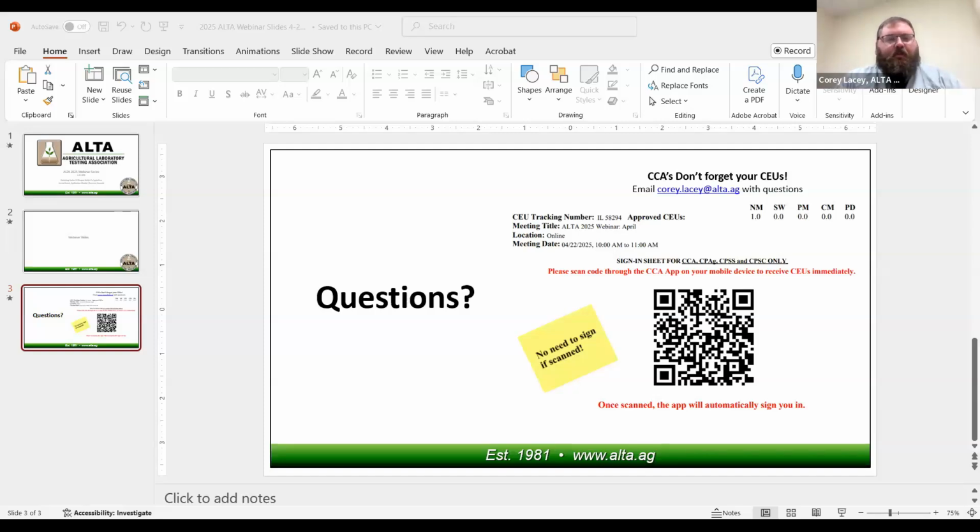This question of sample prep is a massive question in the soil carbon testing industry, because the need to grind is key for accuracy, but it is also one of the biggest costs associated with soil carbon analysis. There's a lot of labs trying to figure out solutions, like can I do a 2 millimeter grind? How fine do I really have to grind this? What is the right sample size?